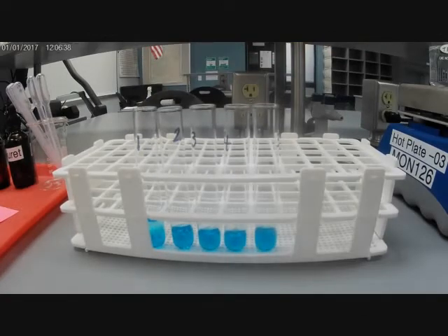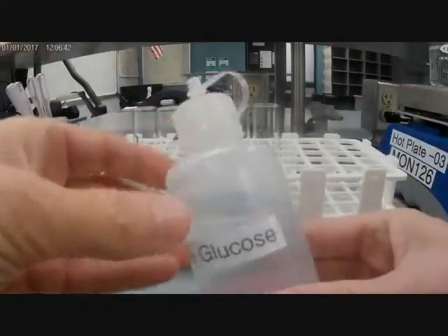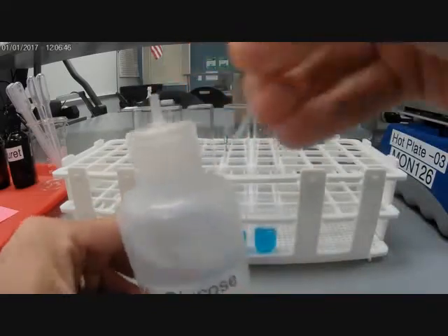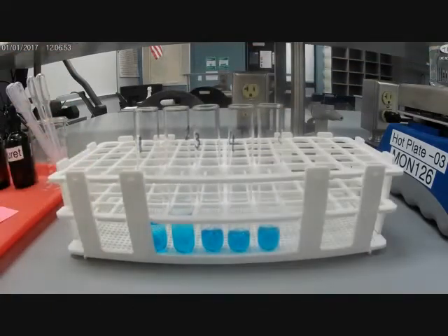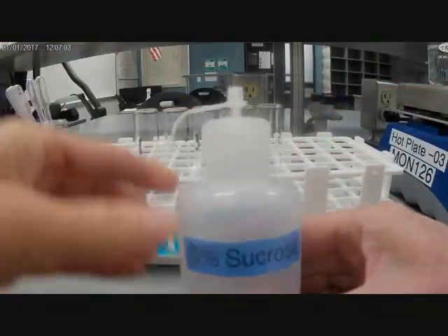All right, tube number two I'm going to put one percent glucose — again, an equal amount to the Benedict's. Tube number three: five percent sucrose.